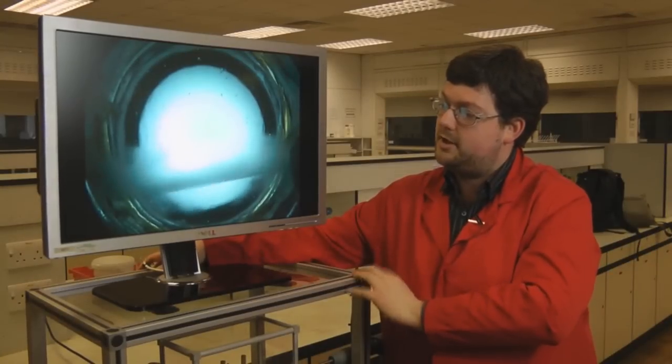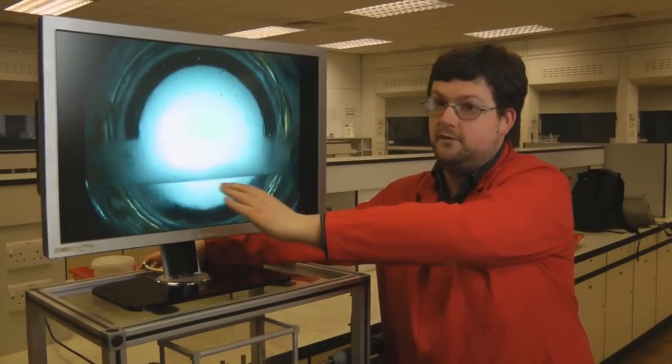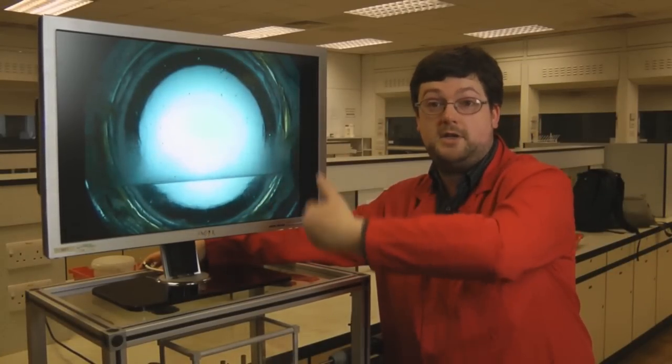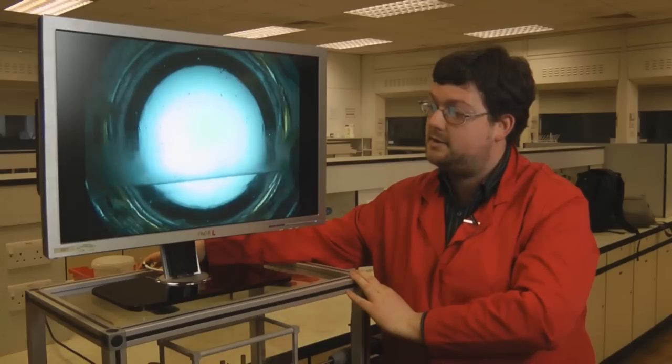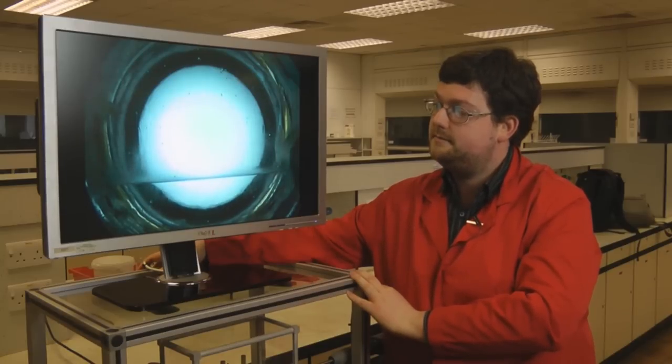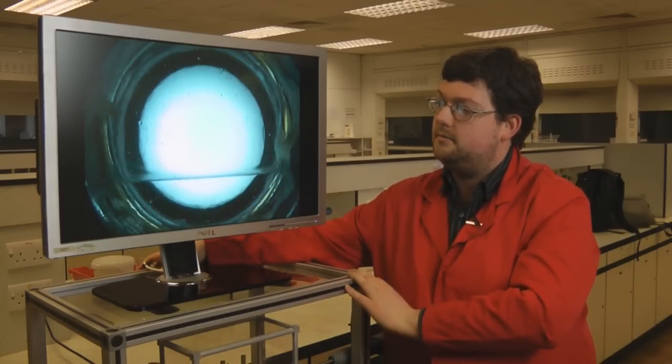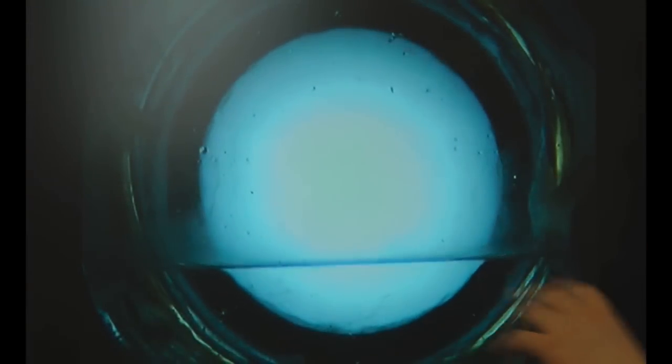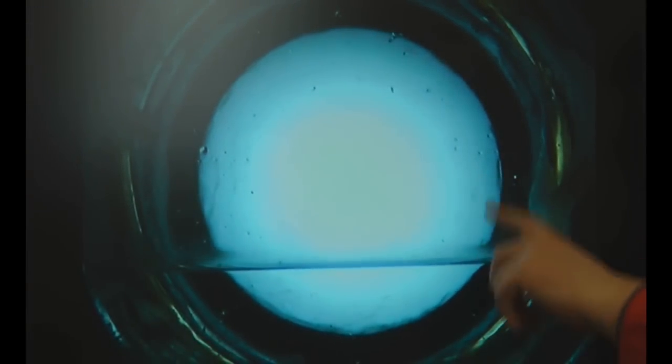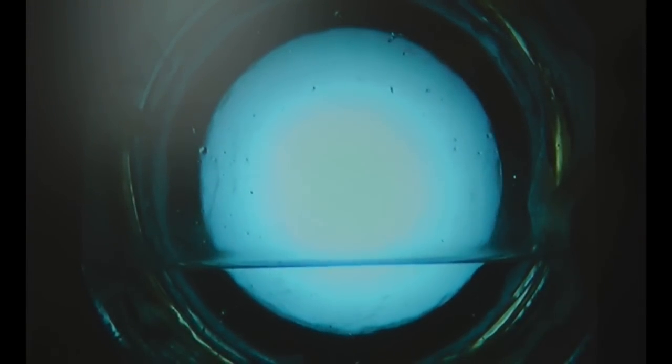If we shake the demonstration, you can see we've re-formed the meniscus—the separation between the liquid and gas phases. It takes a little bit of time for the liquid to completely get back to where it was at the beginning, so we can still see some liquid droplets forming at the side of the demonstration.